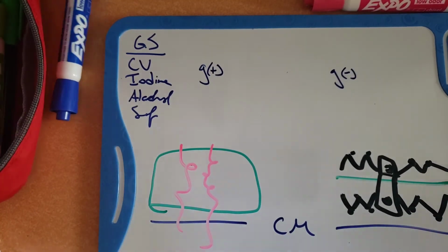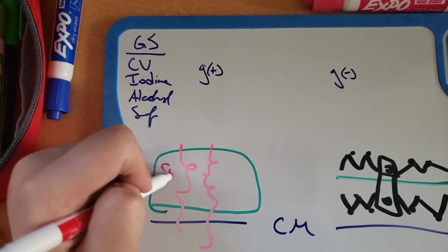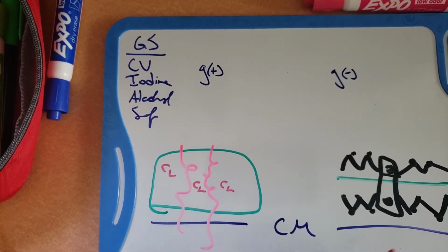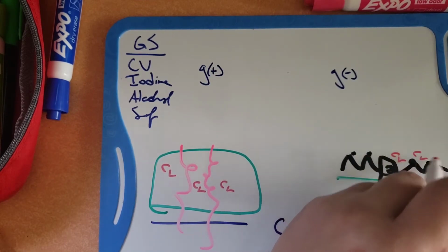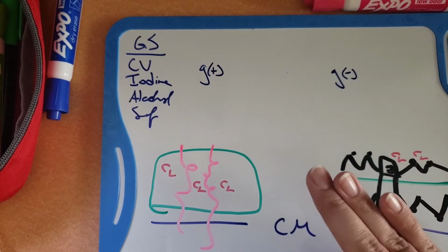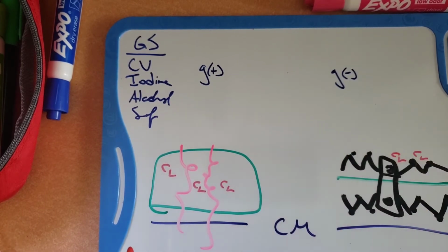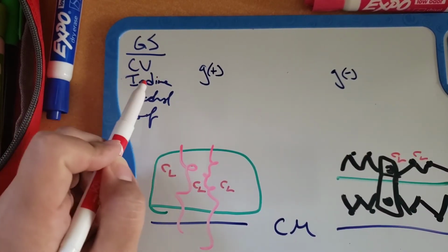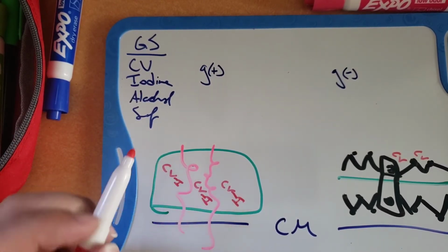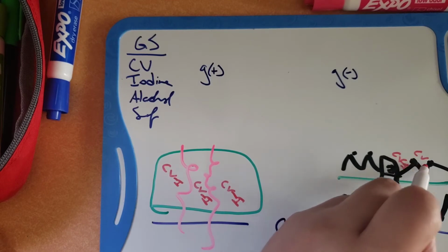So when you are doing the gram stain, if you were in class, you would have the crystal violet step first. The crystal violet will actually penetrate the peptidoglycan of the gram positive, and the crystal violet will actually get stuck in the gram negative on the lipopolysaccharide layer. So the next step would be to use the iodine, and this makes the crystal violet iodine complex.